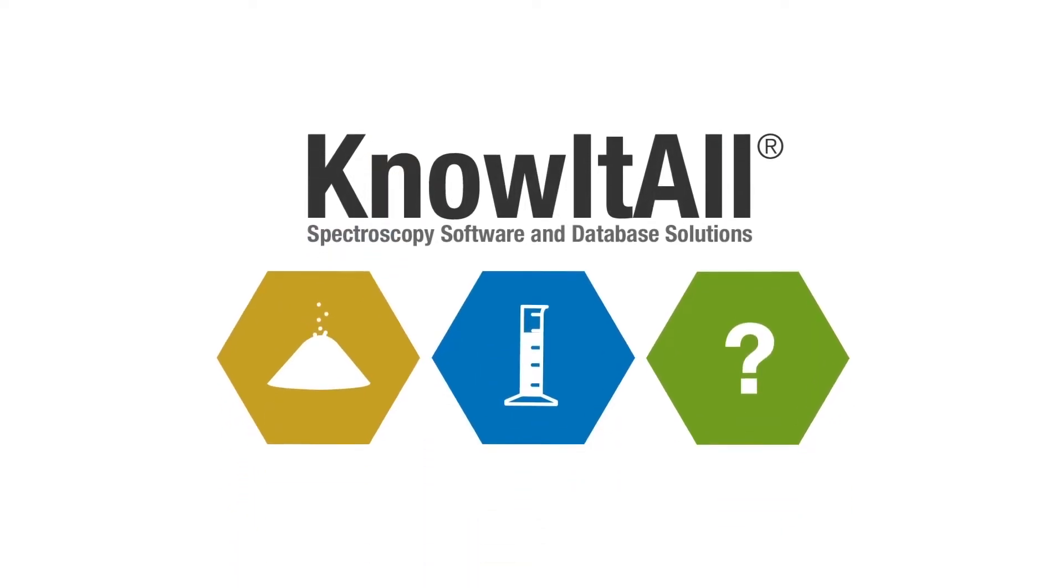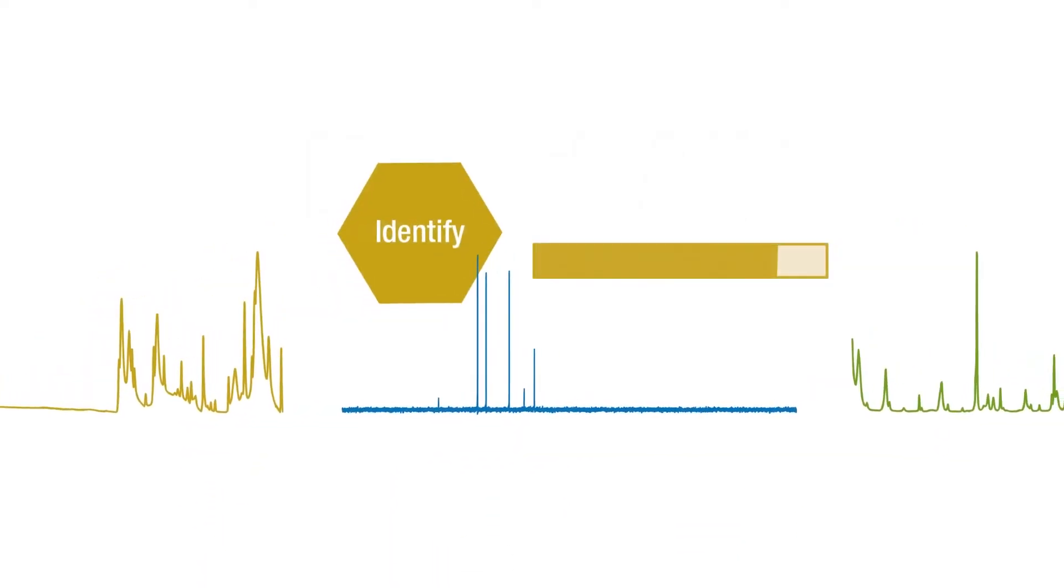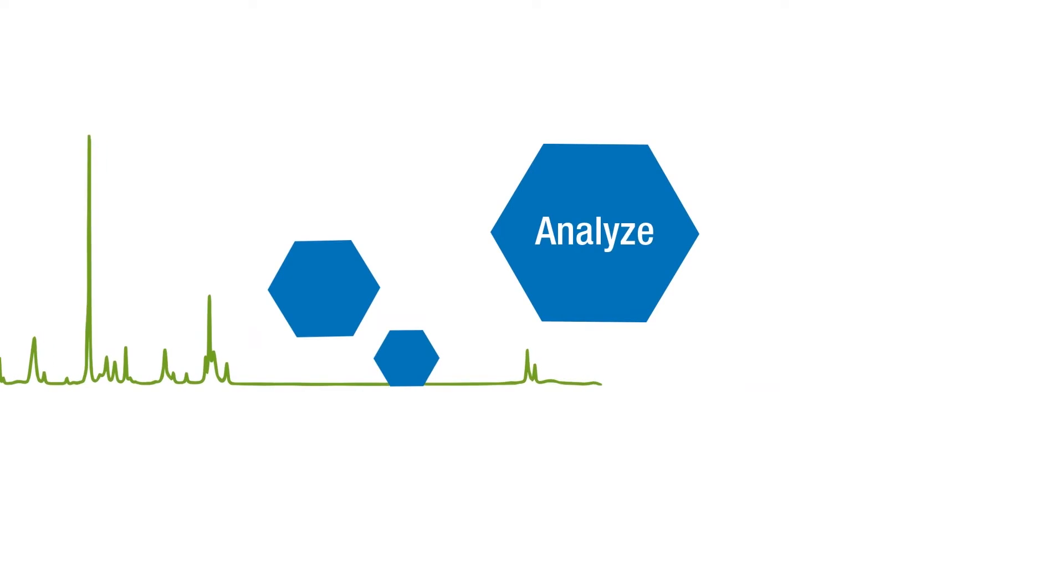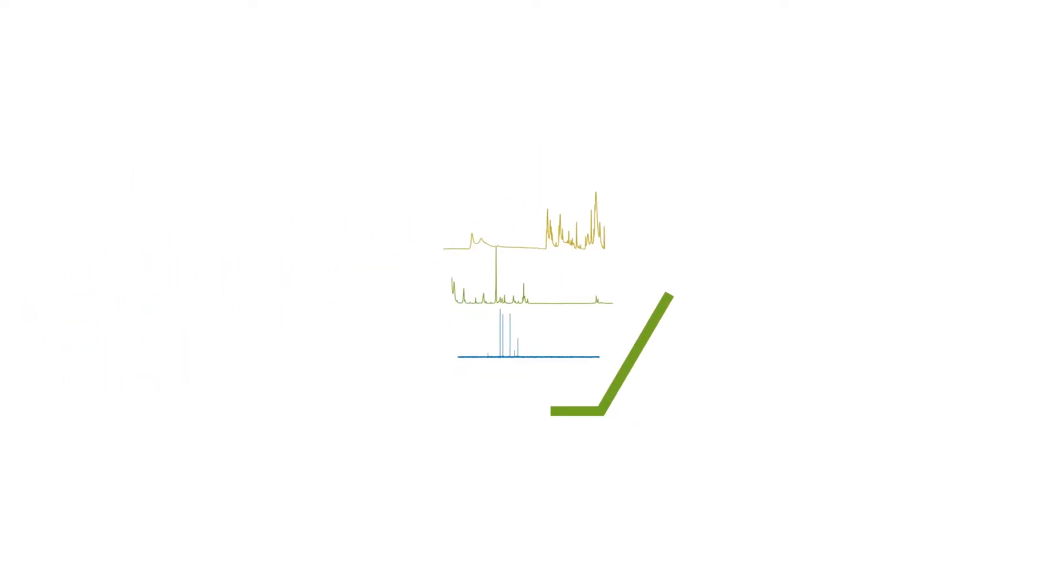Know-It-All software offers solutions to identify, analyze, and manage spectral data.